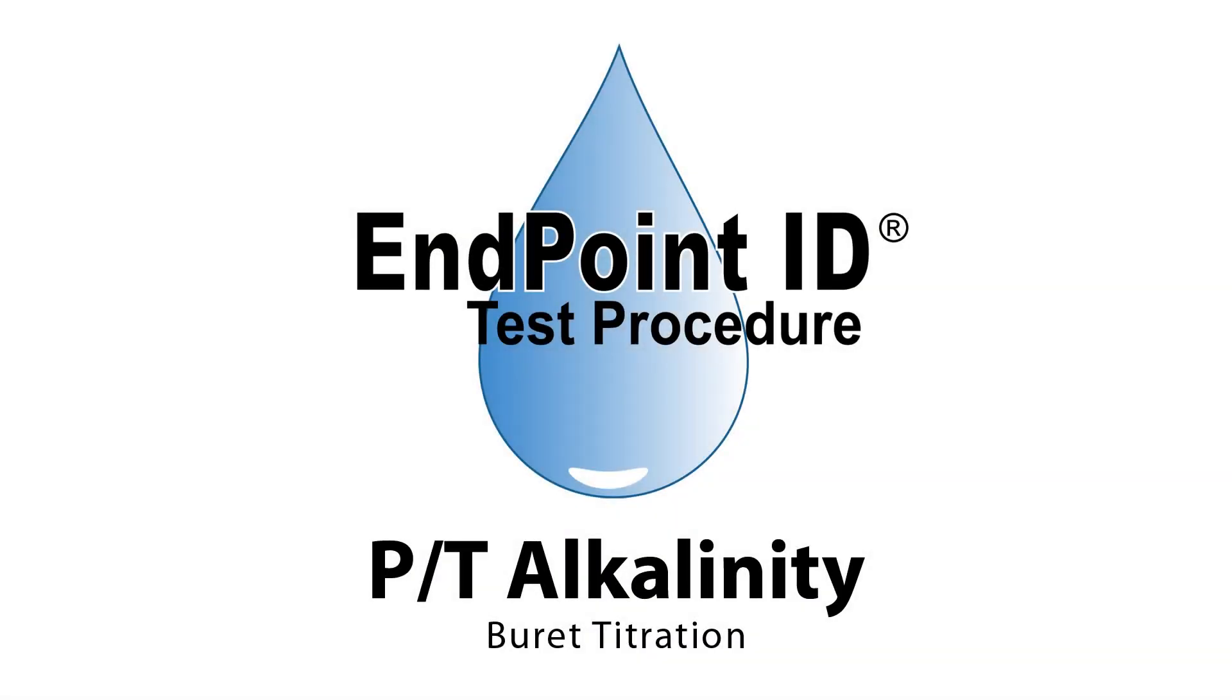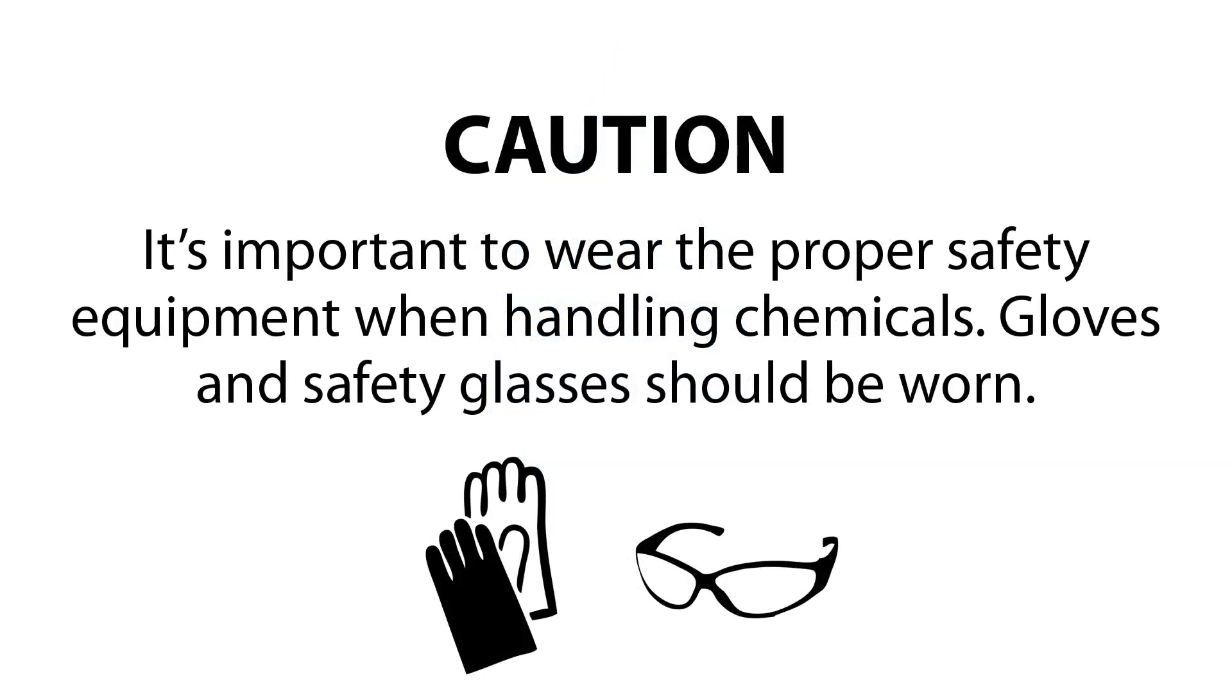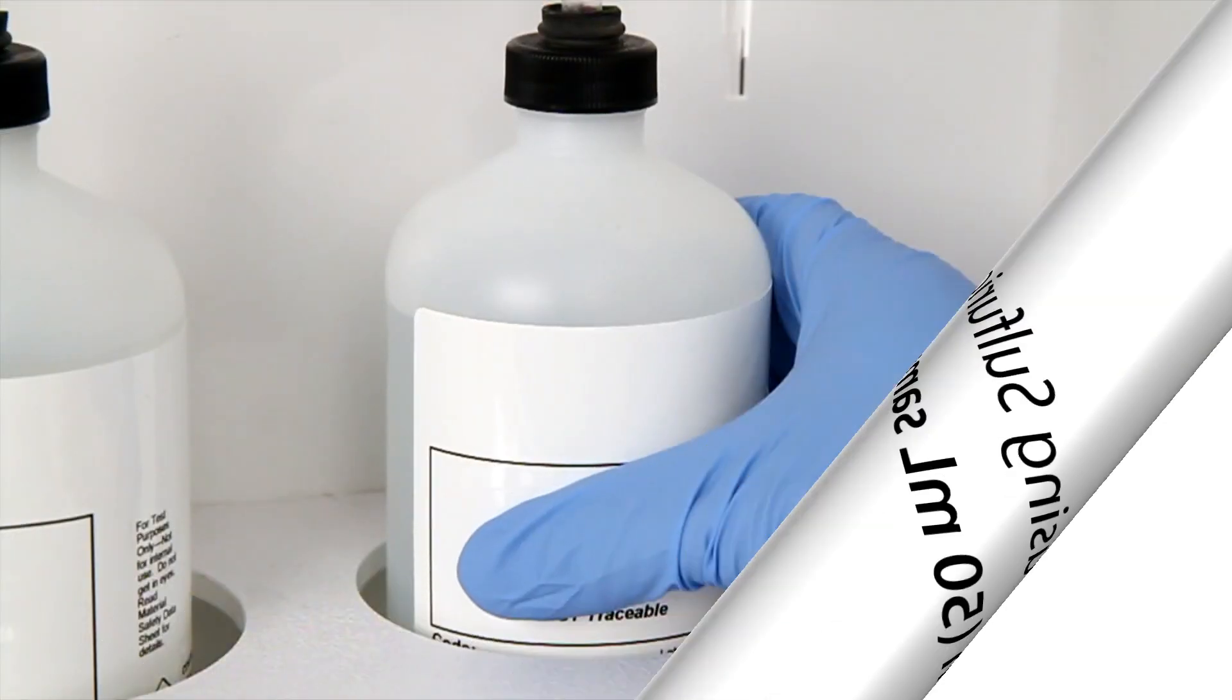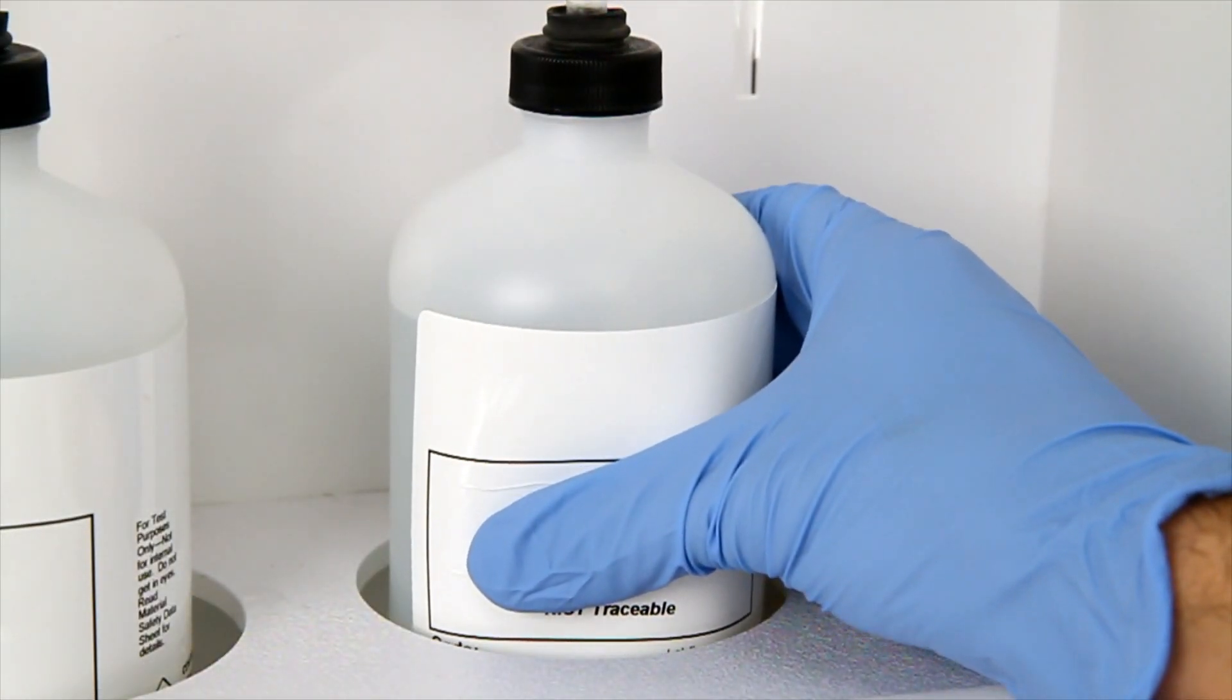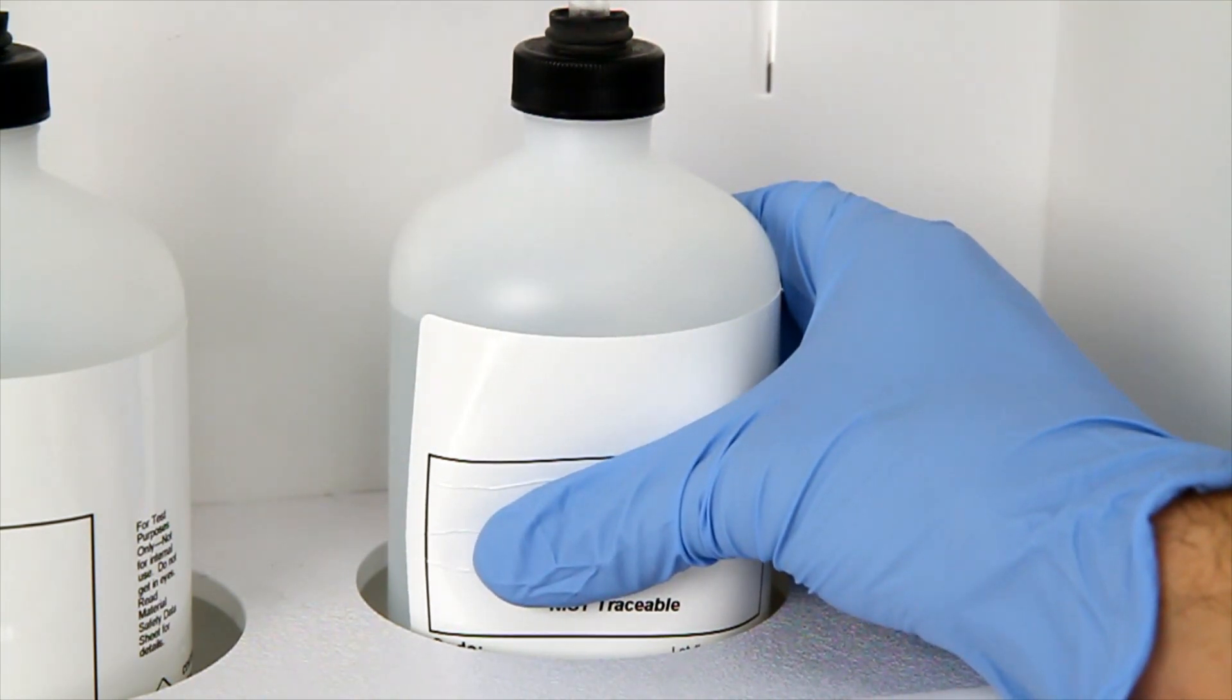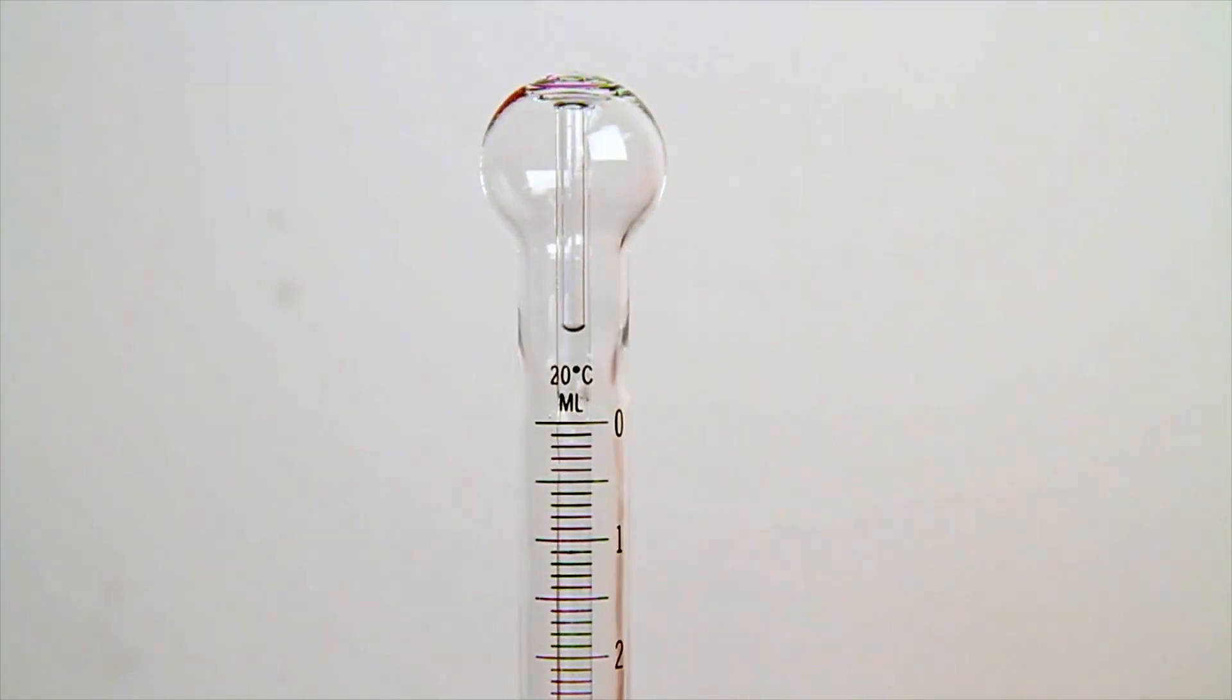This is a demonstration of a PNT alkalinity burette titration. The first step is to fill and zero the burette with sulfuric acid titrant. Zero the burette by squeezing the bottle until the titrant reaches the zero mark.